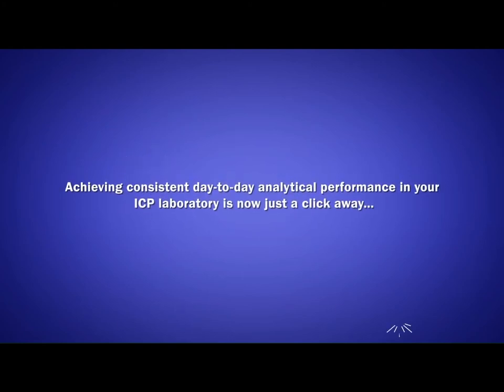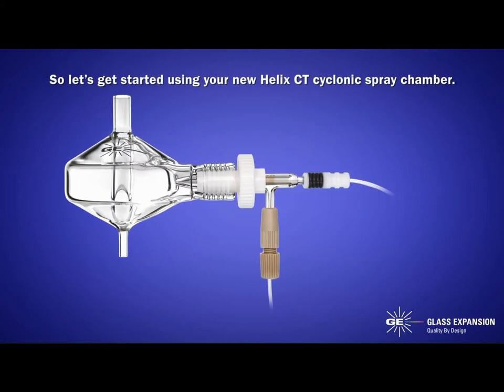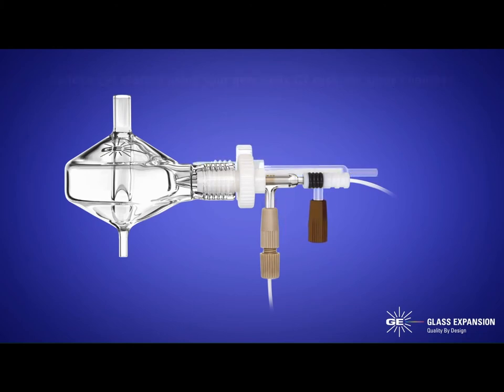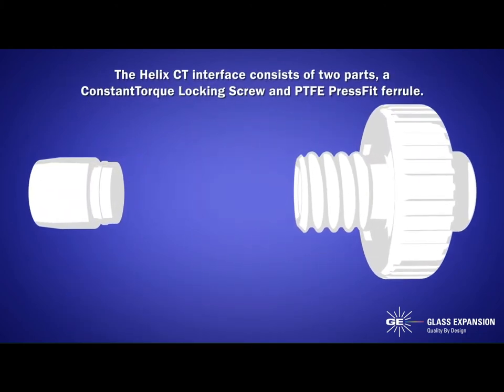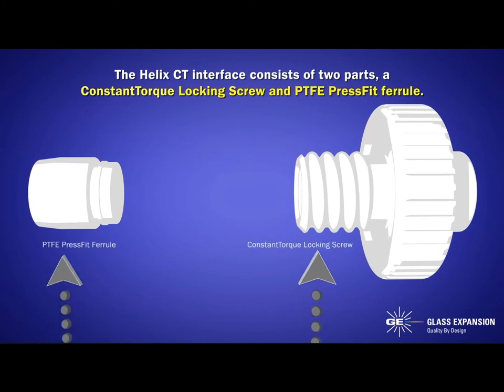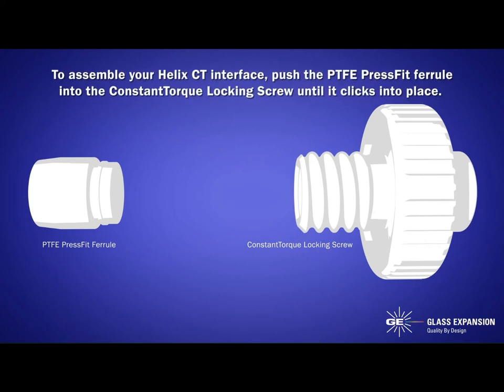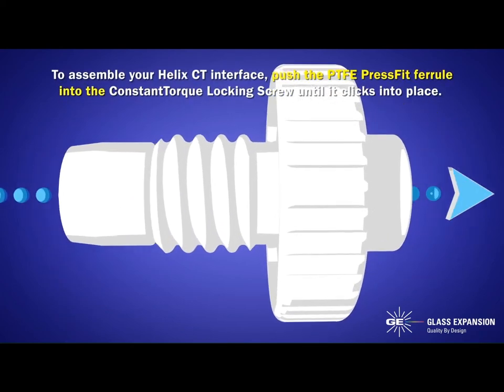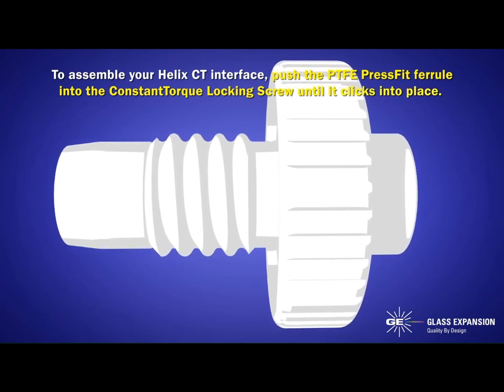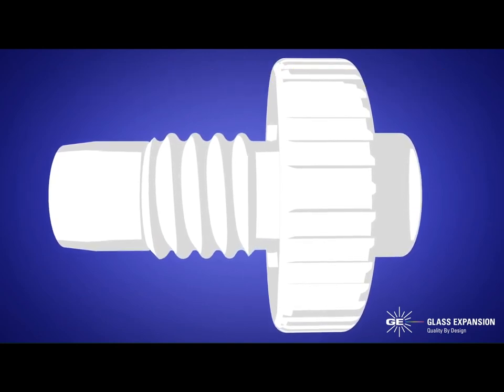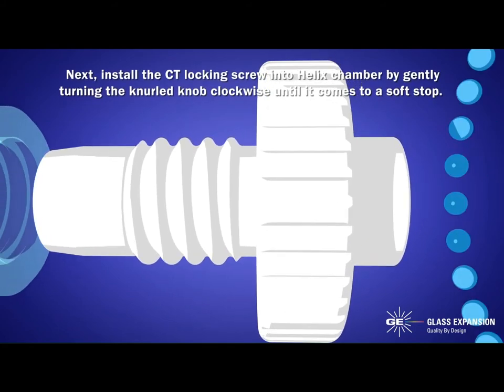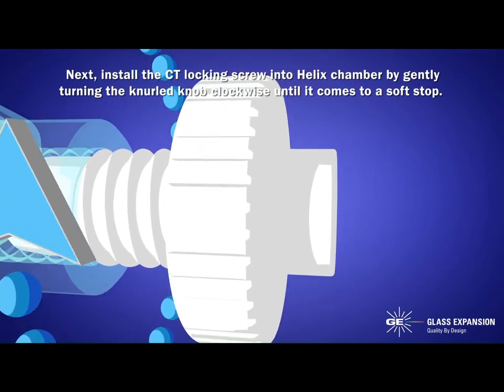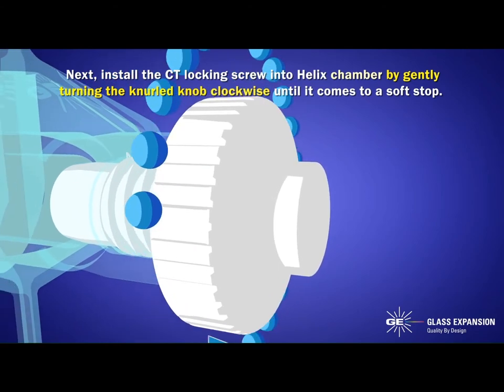Achieving consistent day-to-day analytical performance in your ICP laboratory is now just a click away. The Helix CT interface consists of two parts: a constant torque locking screw and a PTFE press-fit ferrule. To assemble your Helix CT interface, push the PTFE press-fit ferrule into the constant torque locking screw until it clicks into place. Next, install the CT locking screw into the Helix chamber by gently turning the knurled knob clockwise until it comes to a soft stop.